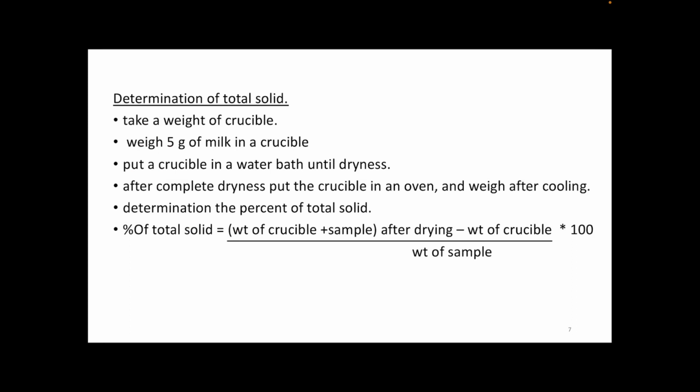What about determination of the total solids, the total amount of solids present in a milk sample? This can be easily determined by using a crucible. A crucible is like a porcelain dish, okay? A small porcelain dish. You first start by weighing this crucible. Weigh it when it's empty, take the weight. Then add 5 grams of milk in the crucible and take the overall weight.